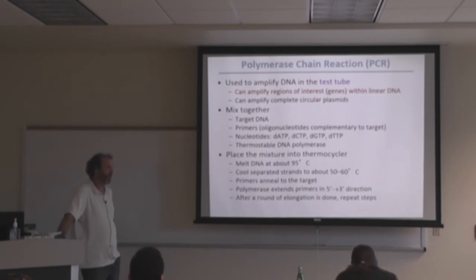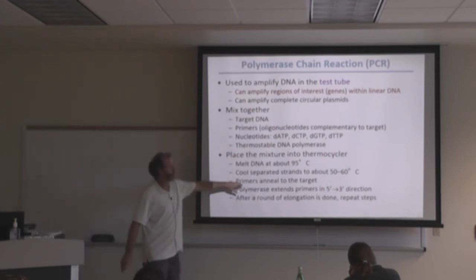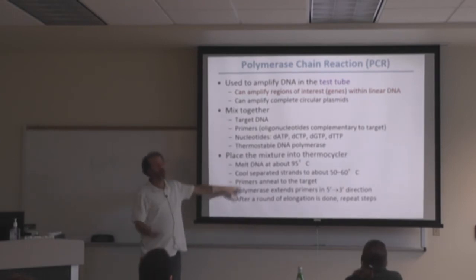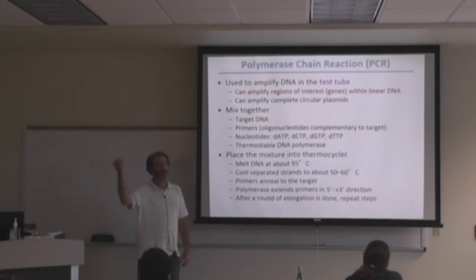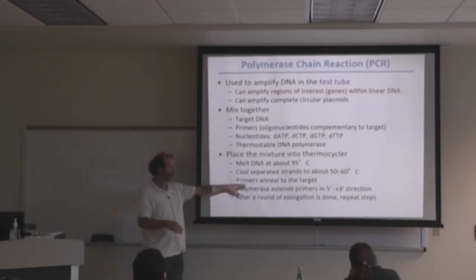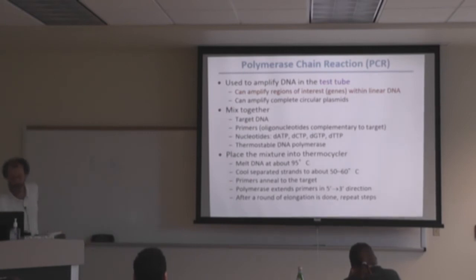So speaking of delta G, what else alters your free energy of a reaction? Delta S. But concentration, right? So if you have a concentration of primers much higher than the concentration of your templates, chances are it's going to re-anneal to primers rather than the template, right? So that's why if you have like that mystery meat in methods one or whatnot, you get a ton of DNA. And if you run the PCR with a ton of DNA, you've got too much DNA for the primers to really anneal versus the template. So you don't end up with bands if you don't really quantify your DNA and get it to the right dilution. So too much DNA is a bad thing also when you're doing PCR.